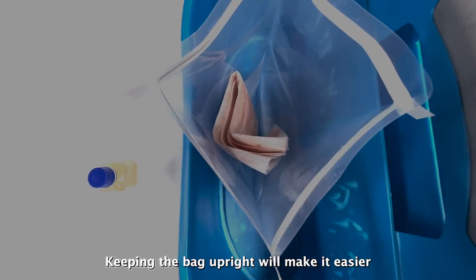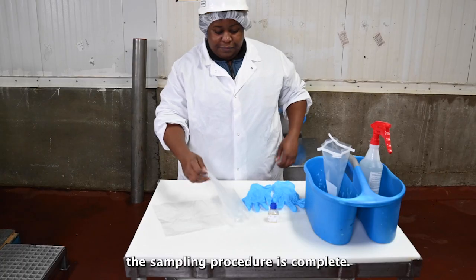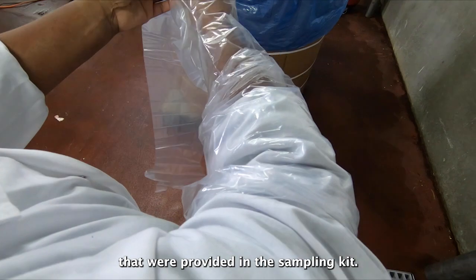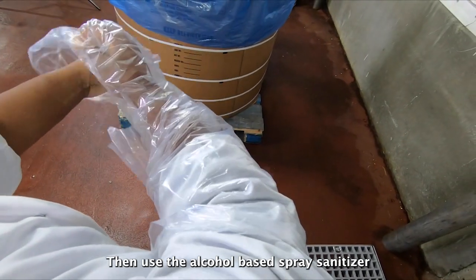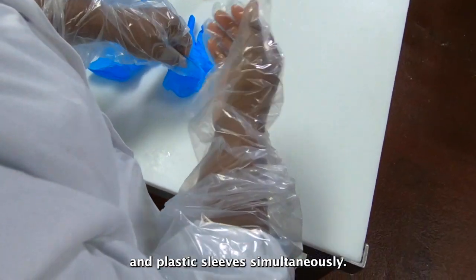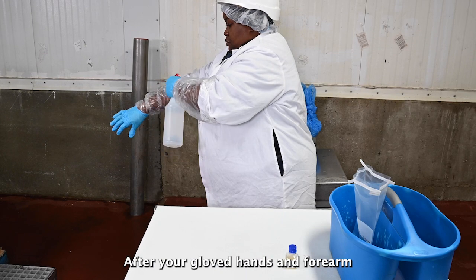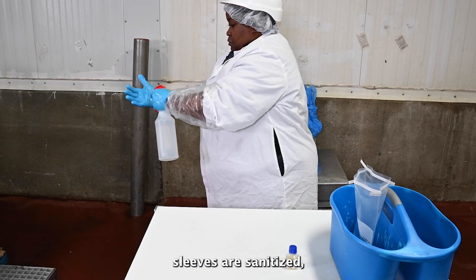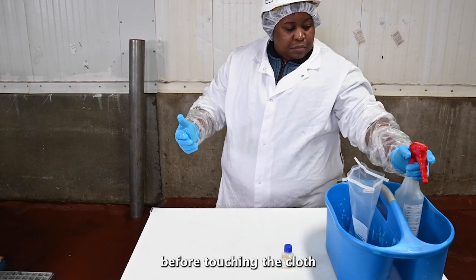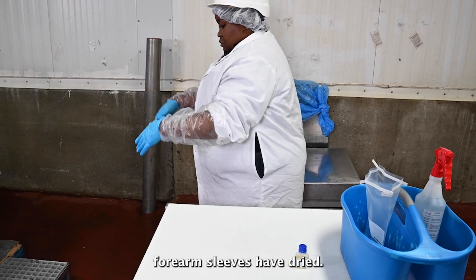Keeping the bag upright will make it easier to place the cloth back in the bag once the sampling procedure is complete. Put on the arm sleeves and gloves provided in the sampling kit. Then use the alcohol-based spray sanitizer to sanitize your gloved hands and plastic sleeves simultaneously. After your gloved hands and forearm sleeves are sanitized, do not touch anything except for the cloth. Before touching the cloth and beginning the sampling procedure, be sure your gloves and forearm sleeves have dried.